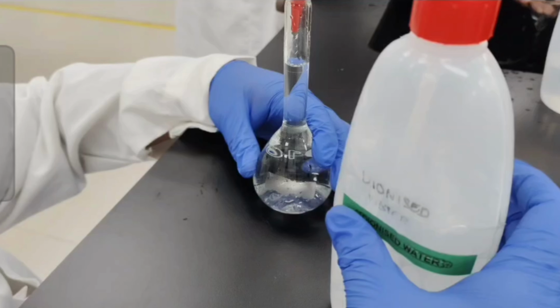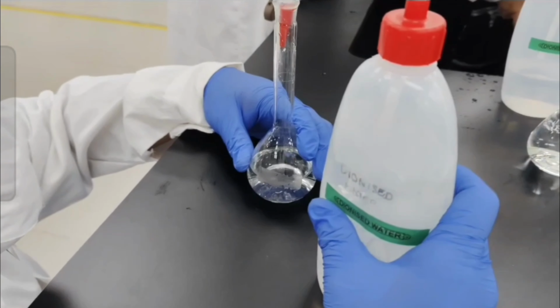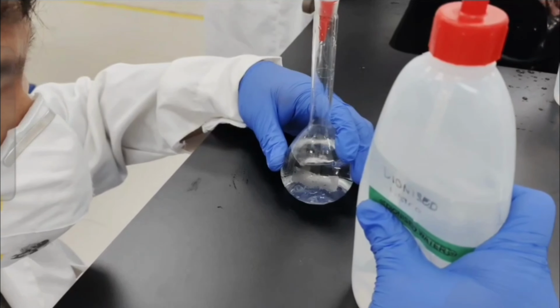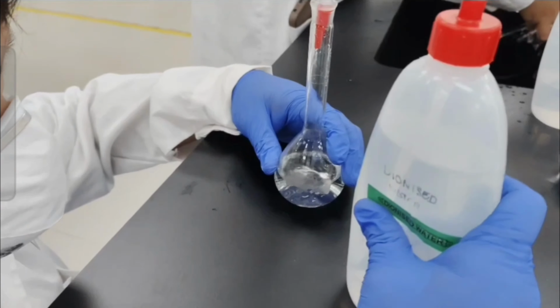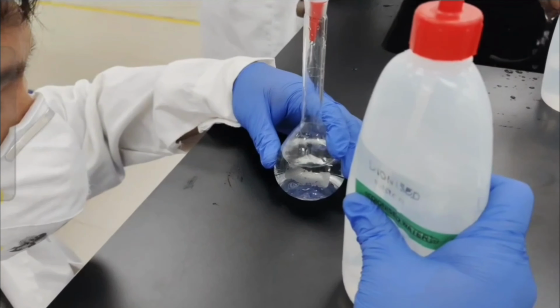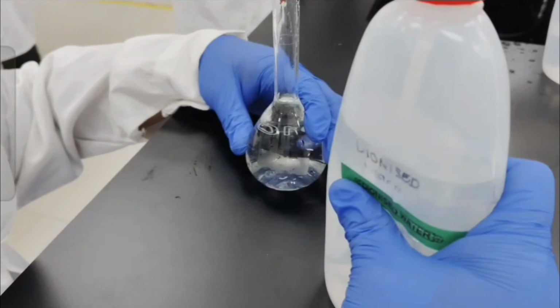We transferred 2 milliliters of Na stock solution of known volume to the 100 milliliter volumetric flask already filled with a bit of deionized water.